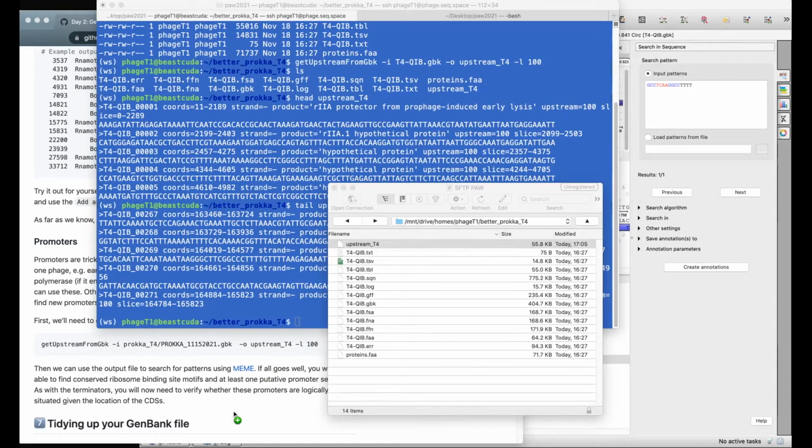Okay. I now have the upstream. I'm quickly having a look at whether it downloaded on my computer, but suddenly my computer is being a bit slow. I'm manually deleting the last one in the text edit file, because I know that it will give a problem when I load it.